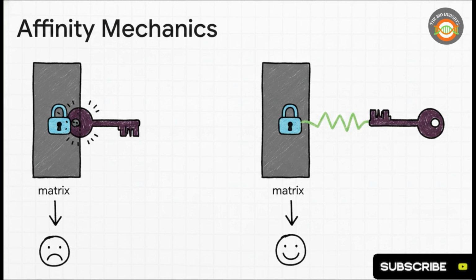Sometimes a target's binding site is buried super deep within its structure. If you just glue a ligand directly to the column matrix, your target might just clunk against the wall, a problem called steric hindrance. So, to fix this, we use these things called spacer arms. It's just a chemical chain that pushes the ligand out into the fluid so it can actually reach into the target.